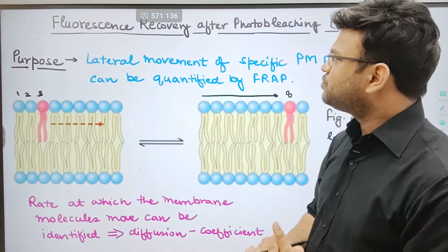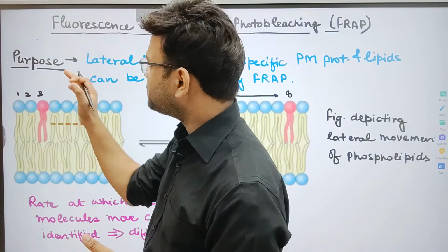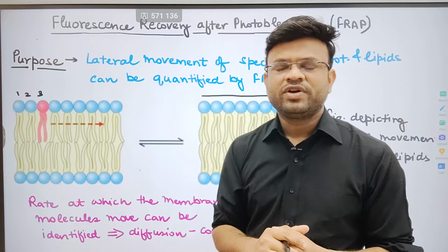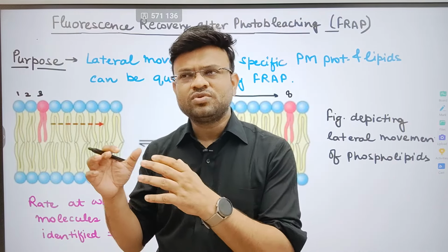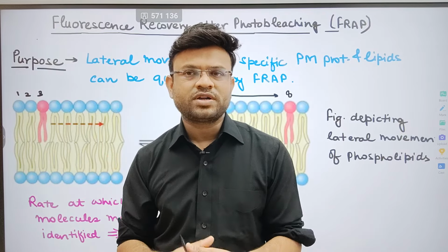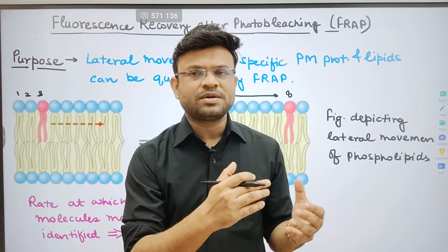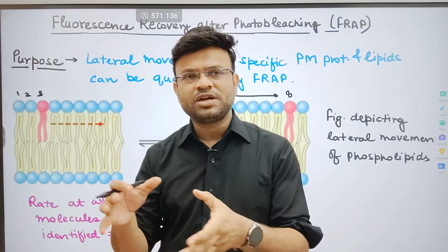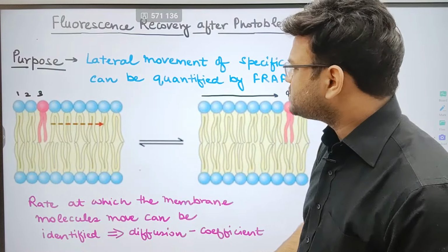What is FRAP? Fluorescence recovery after photobleaching. What is this technique? What is the purpose of this technique? Remember, whenever you are studying a new technique, you should first of all put your brains into finding out why this technique is used. Because until and unless you understand the purpose of that technique, you would not be able to understand the principle or mechanism.